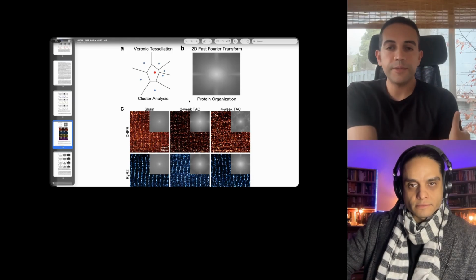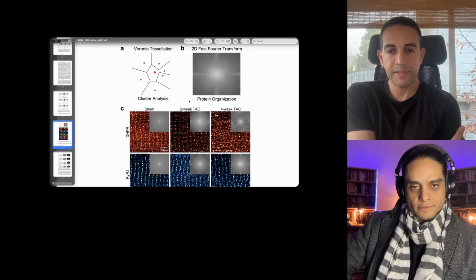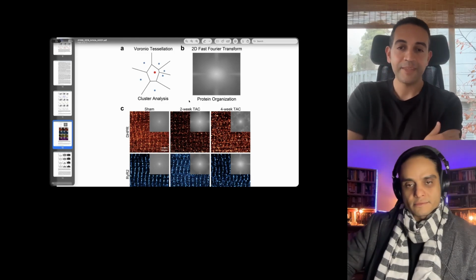There are commercial instruments that now allow you to do presumably 10 colors. But when you dive into it, it gets very specific about which bandpass filter you use and which fluorophores you avoid.